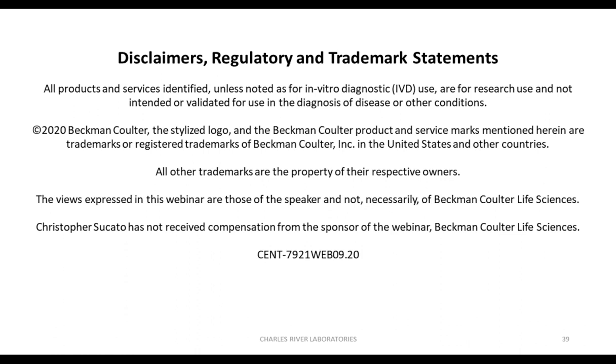While that might seem like a lot, we've noticed over the course of several years that AUC has become an emerging method for AAV drug developers, and the amounts that can be produced from improved manufacturing and process improvements make those kinds of amounts more and more of a reality. So we hope to see more process improvements in the future that will allow these kinds of methods to go forward.